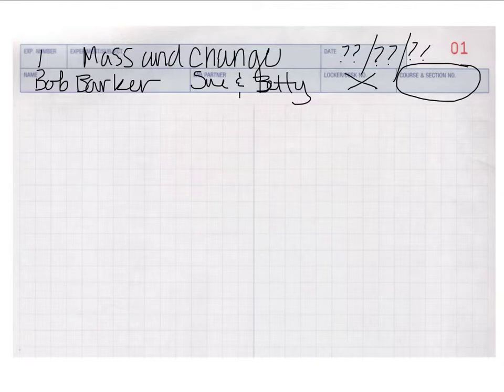You'll want to do all of this in black pen. Why black? Well, blue runs. So if you happen to spill some water on it, blue ink tends to run. You also want to avoid any kind of gel pen as they also run. Pencil is not acceptable. You need some kind of permanent writing material.